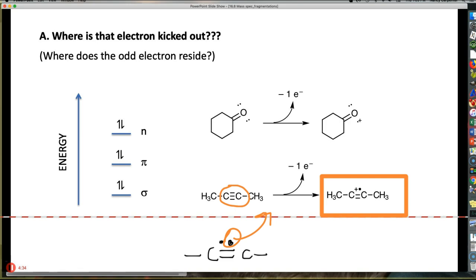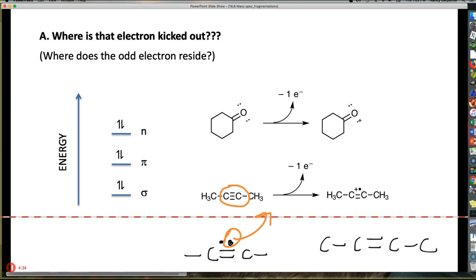Now, it's totally legitimate to ask, why does it look like that? And maybe not like this. Why don't I put the plus over here and the dot over here? Hey, that's also completely reasonable. As I said before, I cannot possibly imagine exactly how this thing blows apart.